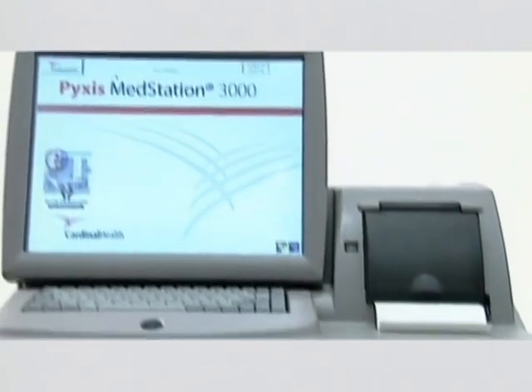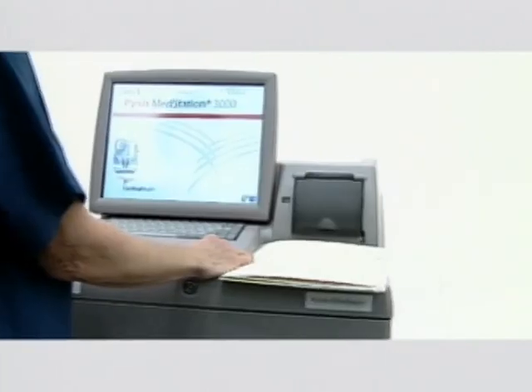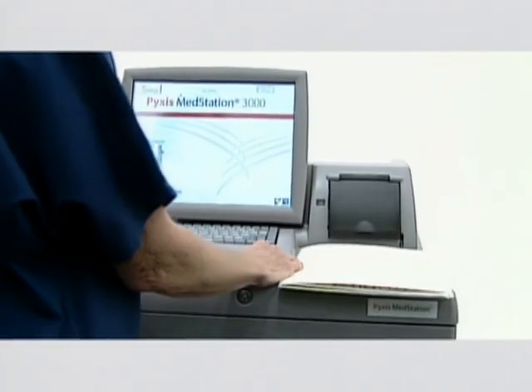The use of automated dispensing devices in inpatient hospital nursing units, clinics, operating rooms, and emergency rooms has facilitated the use of computers for inventory management. Similar devices are evolving in retail pharmacy and hold promise for improving safety, efficiency, and assisting in inventory management. These devices are essentially pharmaceutical vending machines that allow both unit dose and bulk pharmaceuticals to be stocked securely on a given patient care unit location.